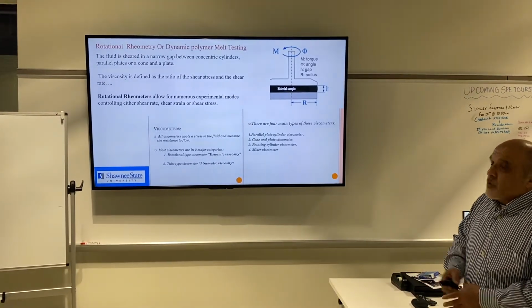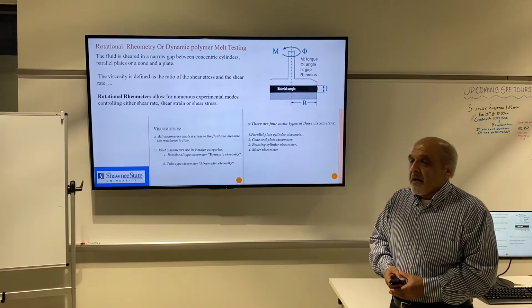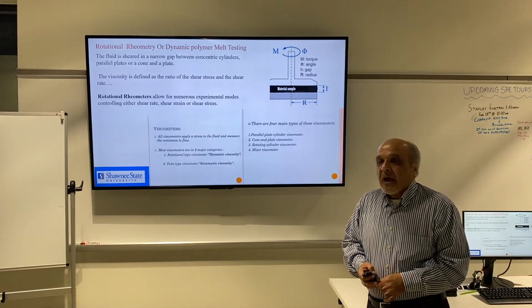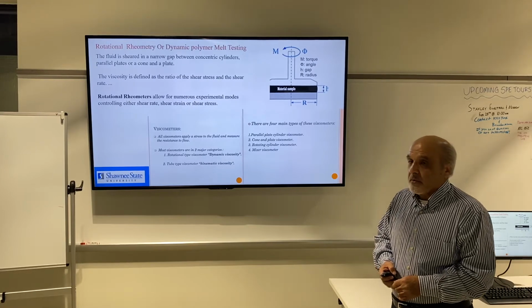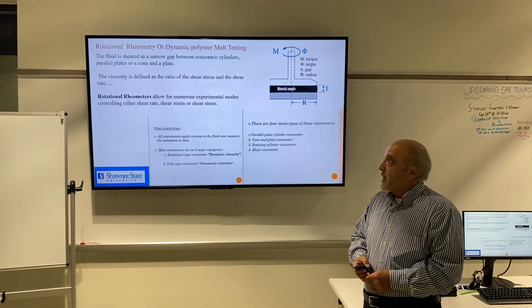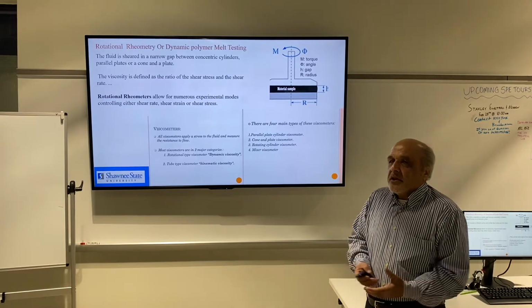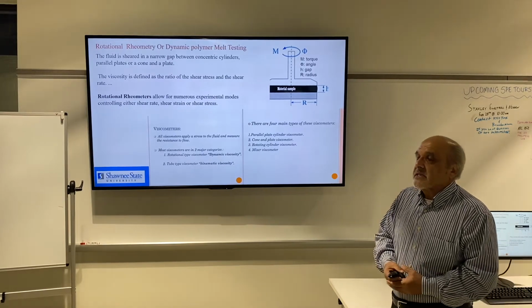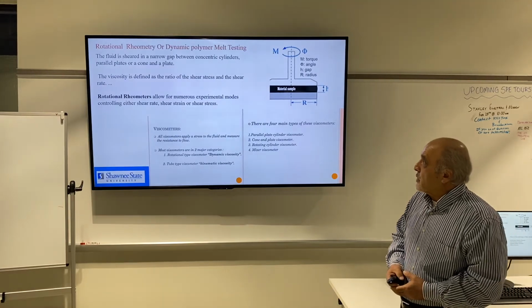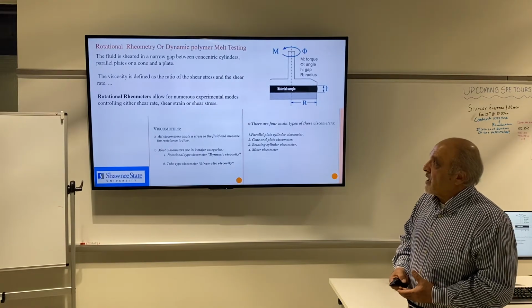I would like to mention what you are going to do regarding your lab report. This is related to your fourth lab report, which covers the melt indexer, capillary rheometry, and rotational rheometry that I'm going to cover today. Whatever you learn from those experiments, you are going to put in your lab report. Because the labs are canceled, you don't have any data, so I don't need any data in your lab report. You just provide whatever you learn from the experiment, from the subject.